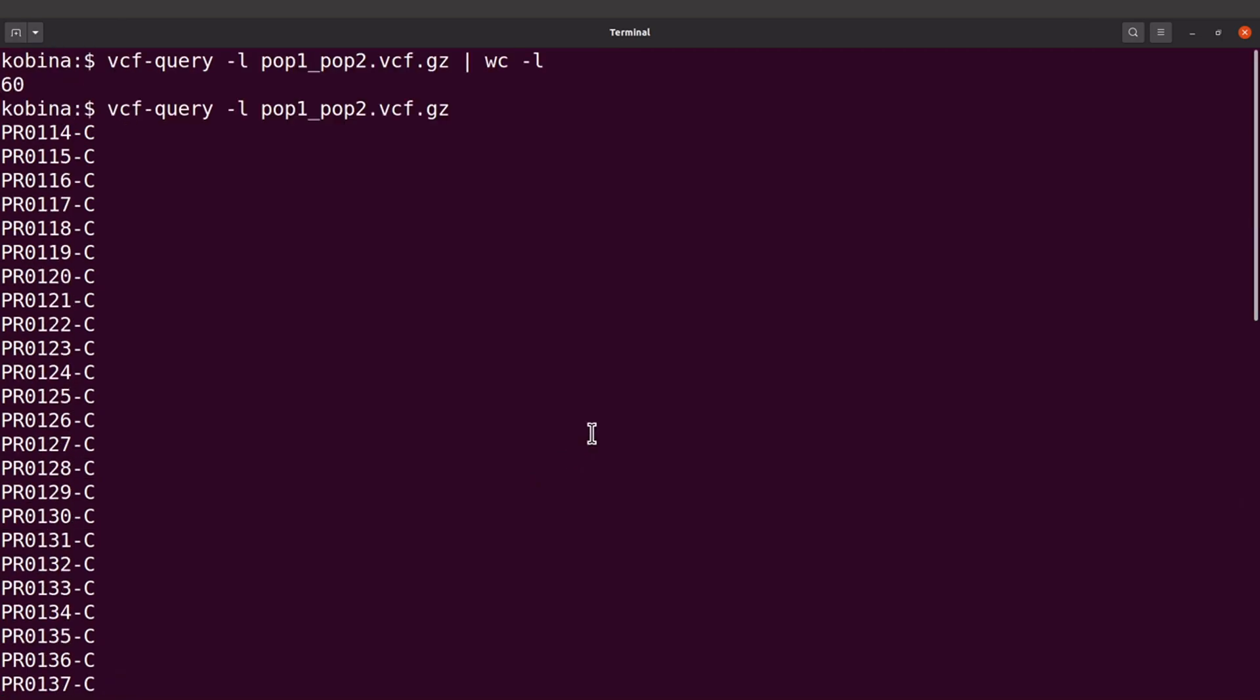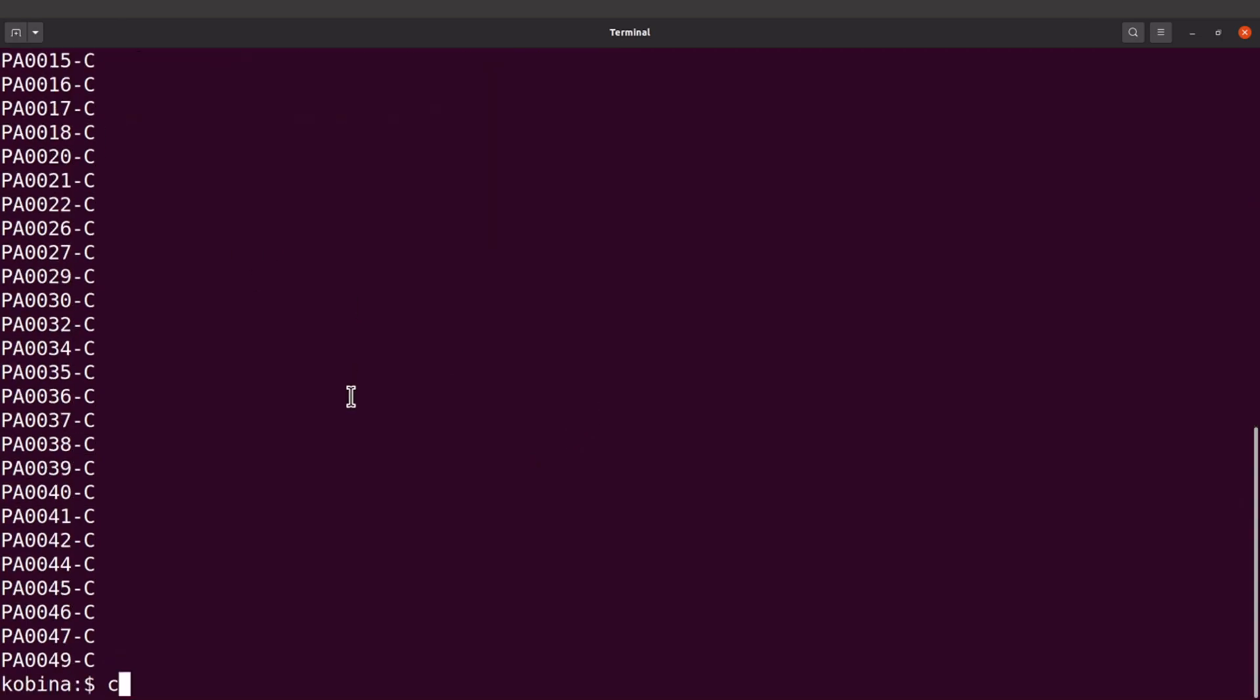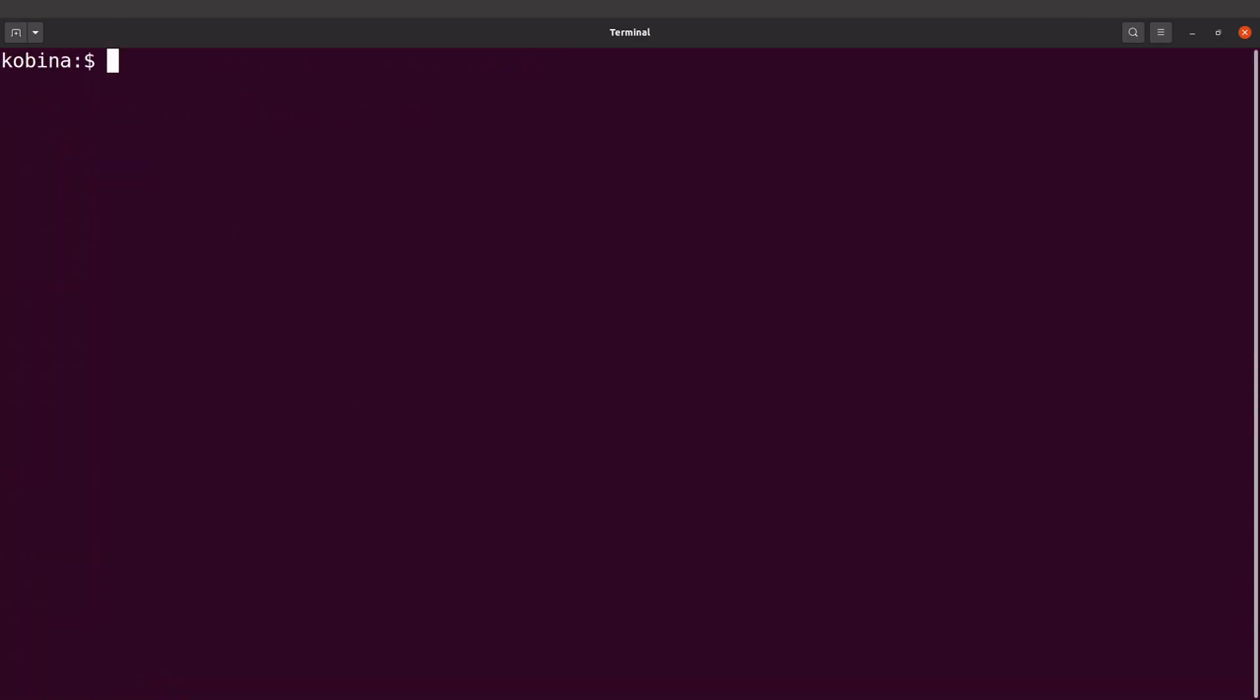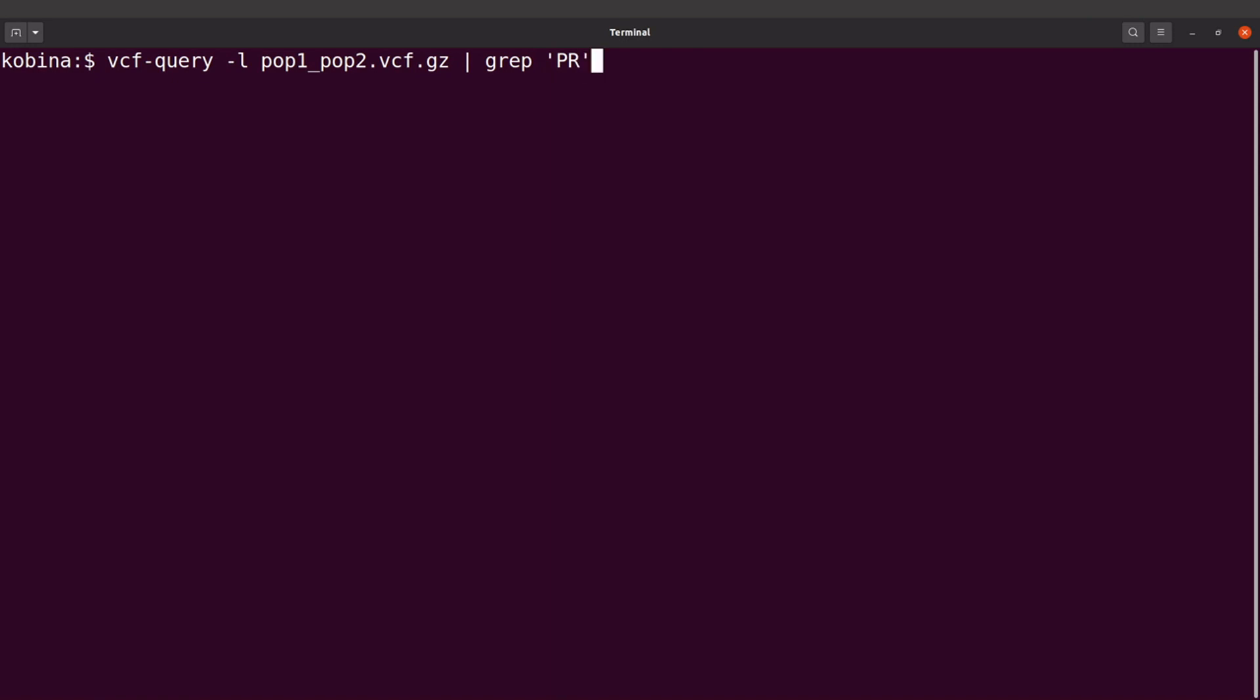Okay, so I'll start with PR first. So I'll say vcf-query -l, I'll supply my file name, that's for the VCF file. And then I'll use a pipe and I'll say grep and I'll say PR like this. Okay, PR. So basically what I'm doing is I'll have the list displayed and then the grep command here will look for this part, PR. So all the samples that have PR in them will be displayed.